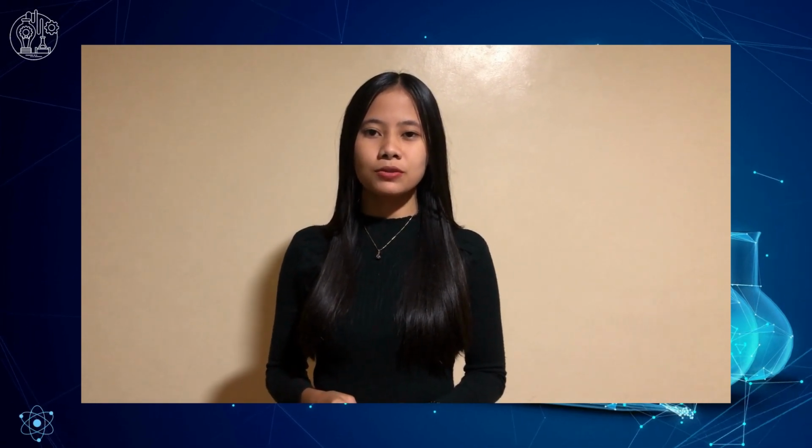Pleased to present an oral report that shows various demonstrations of our ability to synthesize information, construct coherent narratives, and communicate ideas effectively. The content of our oral report is about an experiment entitled The Laws of Chemical Reactions, which we are going to embark on a journey of exploration, analysis, and knowledge dissemination.